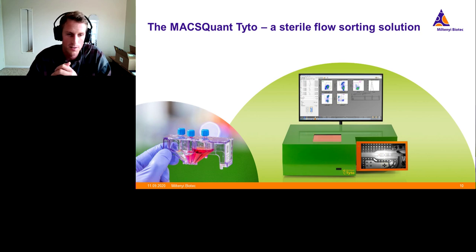That cartridge, once it's closed, is presumably safe to use. And I hope I can make the case that we don't see aerosols coming off of this cartridge at all. So handling this outside of the hood is something that we've deemed is certainly better to work with than an aerosol device.